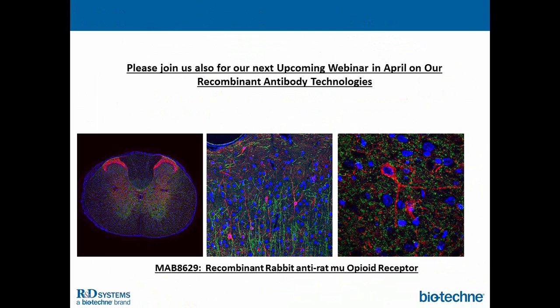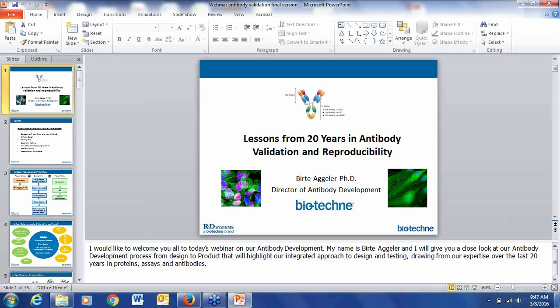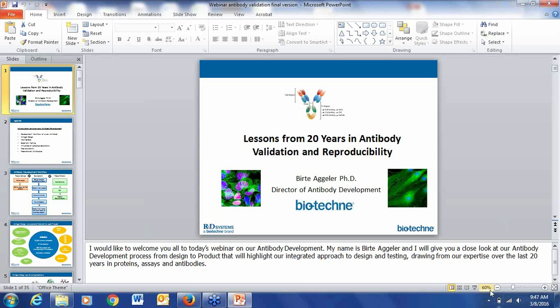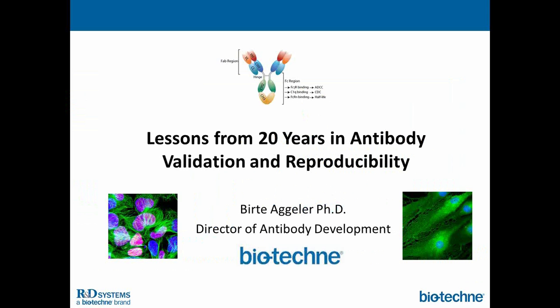I see. We've also had some problems with non-specific phosphoproteins, phosphoantibodies to our proteins. It appears they also pick up non-phosphorylated protein. Do you do any kind of specific testing to ensure that the regular protein doesn't get picked up as well? Yeah, so when we develop phosphoantibodies, it takes us a long while because of all the controls we run.